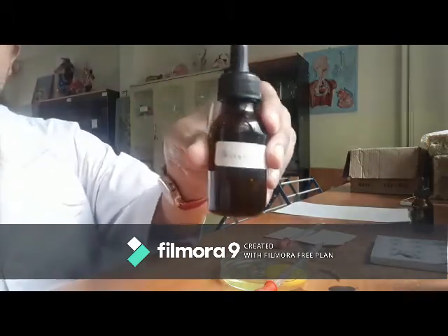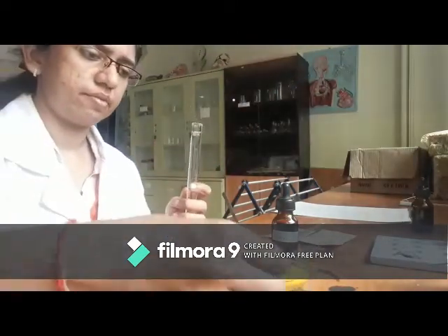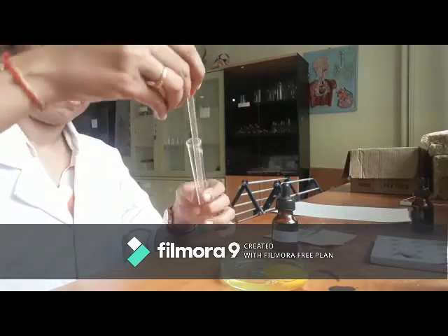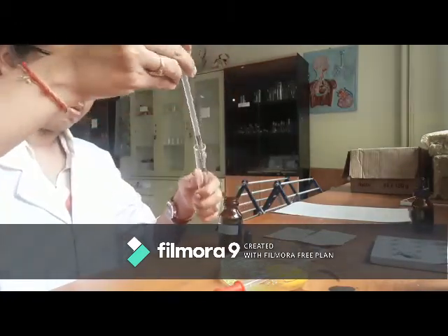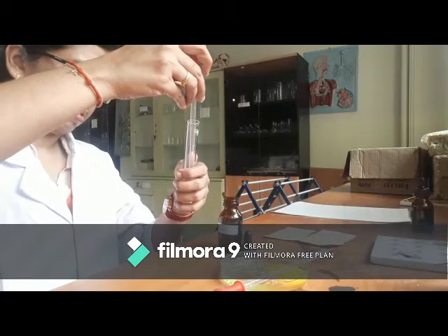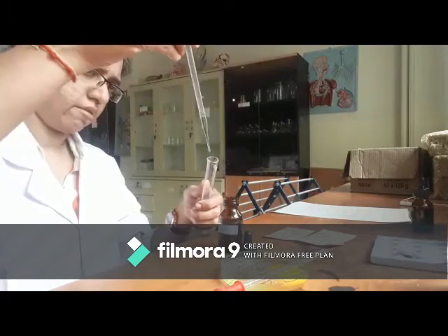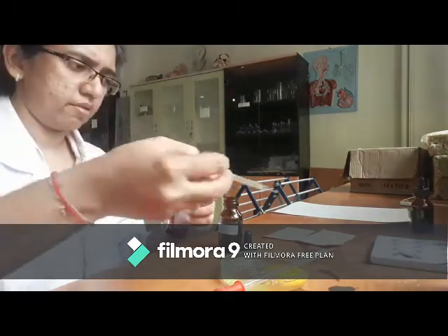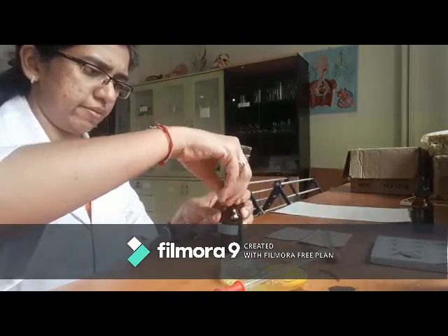The second test is the biuret test. As you already know, egg is a rich source of protein. We can also use tofu, etc. Okay? Take about 5 ml of egg white and 5 ml of biuret reagent. Mix it. As a result, you can see a violet color. Okay, so this proves that egg has protein in it.